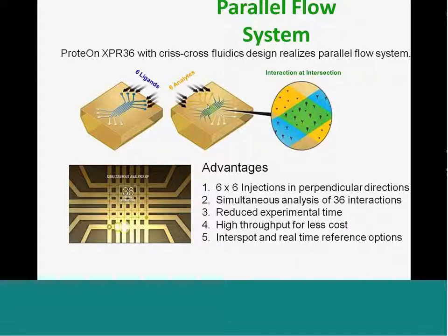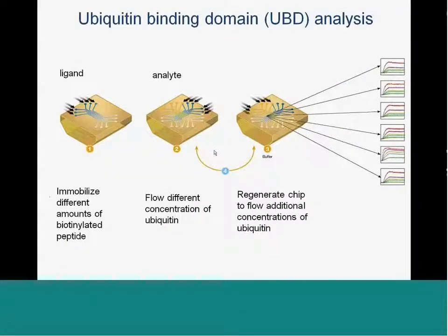I know I'm probably talking about that very quickly, but the advantage is that you can do multiple dose response curves with different ligands, which offers the ability to get full-blown dose response curves within one session on a single chip, which is what we've done with our study. In one afternoon, you can get a full analysis and good concrete data from a single chip.